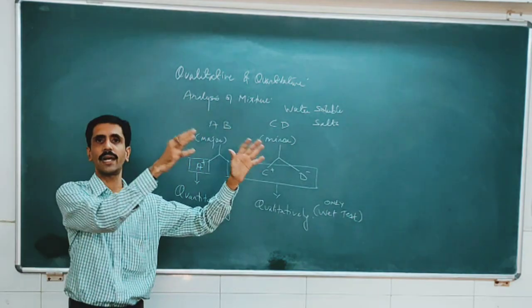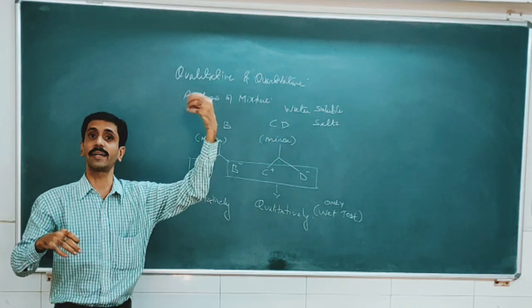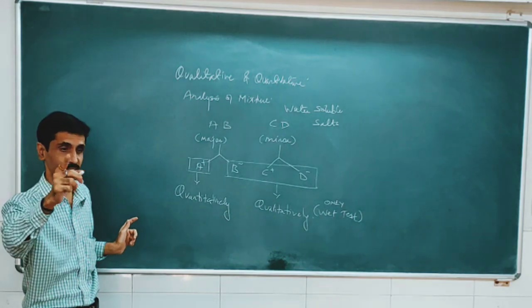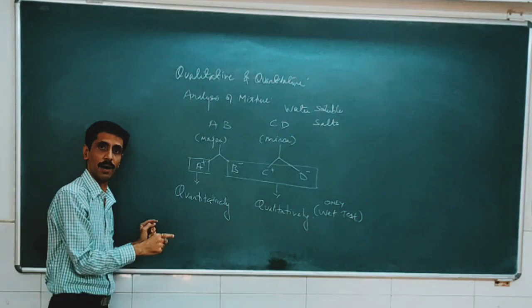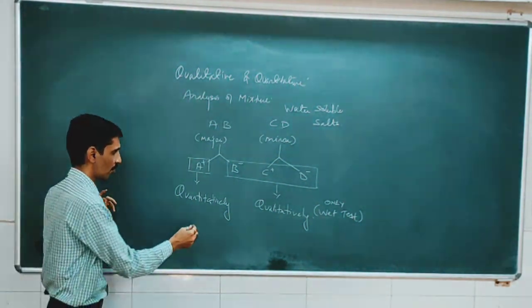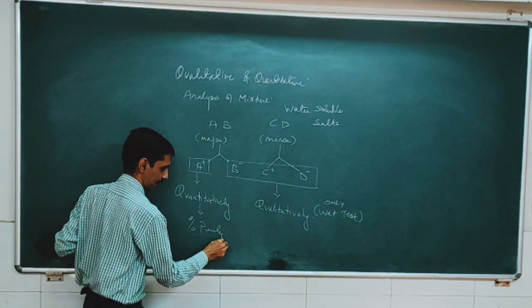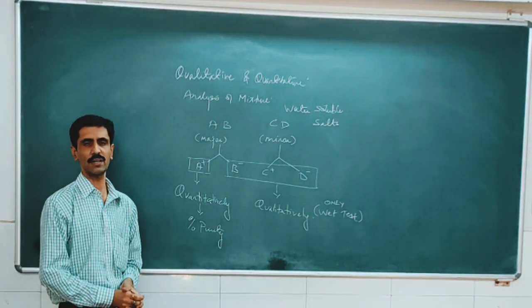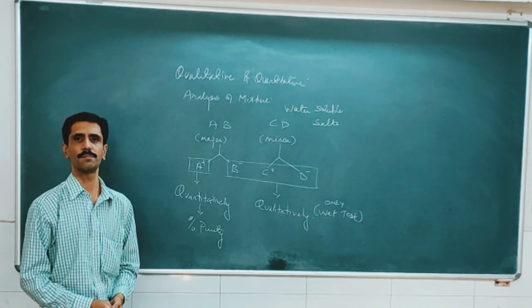The first one is inorganic preparation, where we were looking into that particular part from the quantitative approach. Here we are looking into it from both the quantitative as well as qualitative side. Also, my dear friends, once I find out the amount, then on the basis of the amount I can also identify the purity. So we need to go one step ahead and find out the percentage purity of the major cation present in the mixture. Alright, so I hope you have understood this scheme of experiment very well.